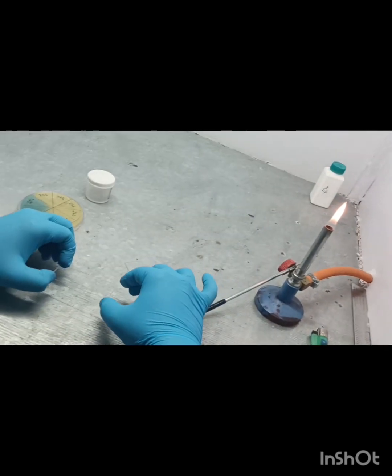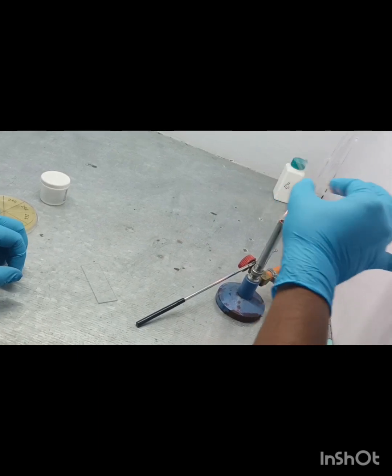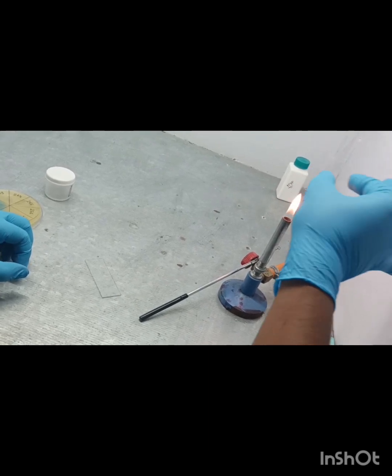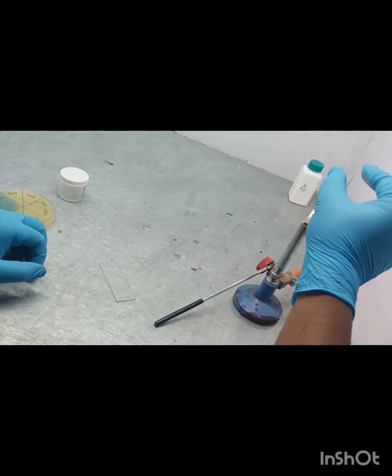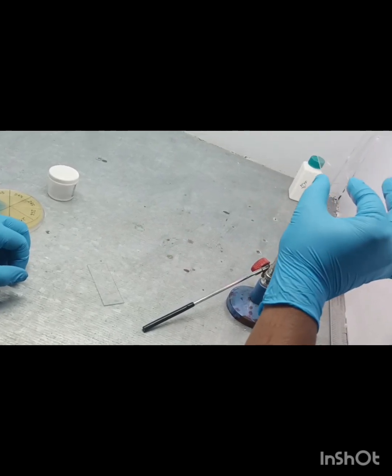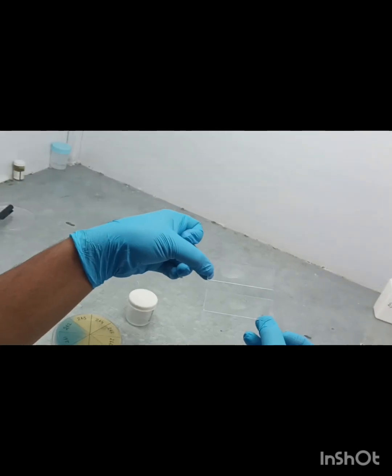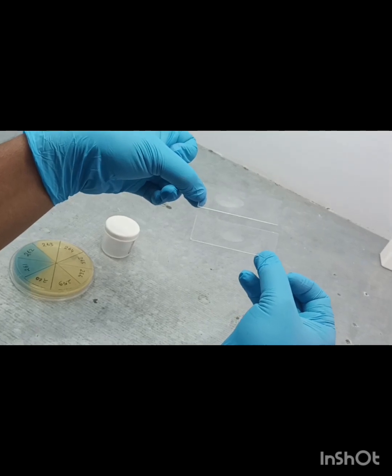Okay, what is the reason for heat fixing? There are two reasons. One, it can decontaminate it. Number two, at the time of washing in the gram stain procedure, the bacterial cell wall easily attaches to the glass slide, so it never washes off from the slide. This is the prepared smear. Now we will perform gram stain.